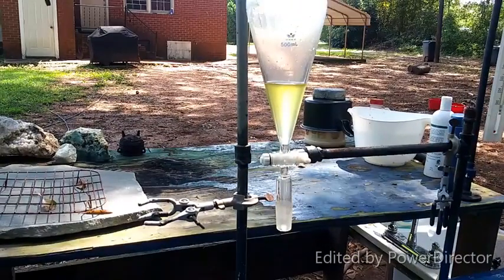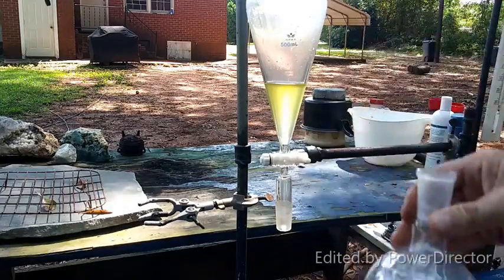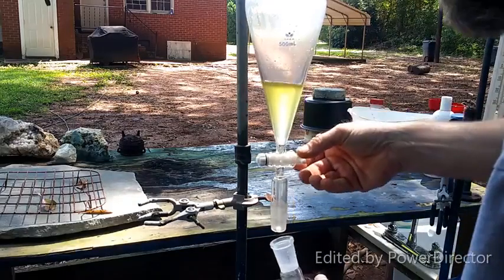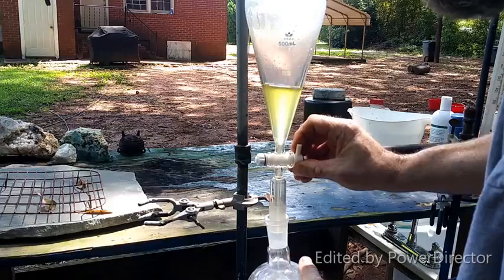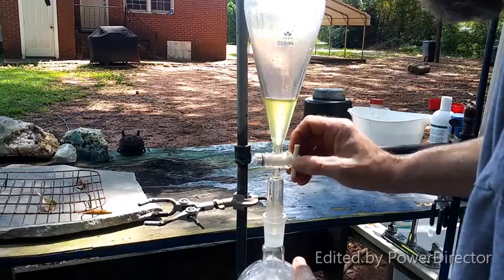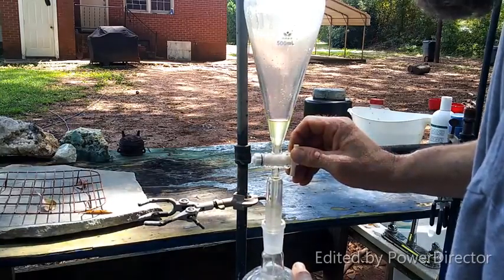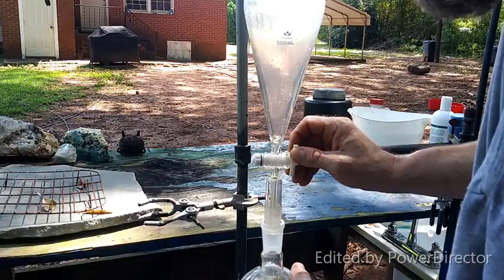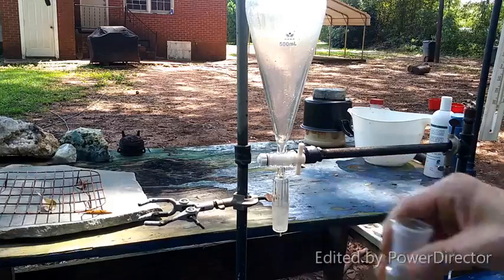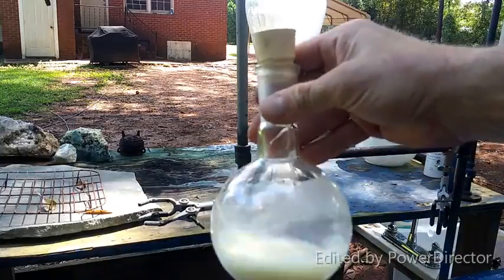Alright, so I have a dry round bottom here with some anhydrous magnesium sulfate. And there we go. Keep it capped.